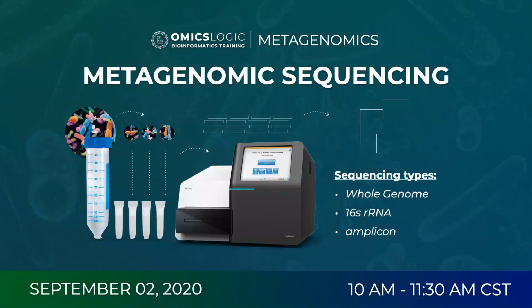So to study microbial communities or microbiota, we will learn about these different methods of sequencing and how that impacts the selection of different downstream analysis and processing of the data. A good understanding of the way this data was prepared will actually help us navigate different types of research studies and read library preparation protocols that are typically going to be mentioned whenever you come across a data set. So remember that metagenomics refers to both a research technique and a research field.